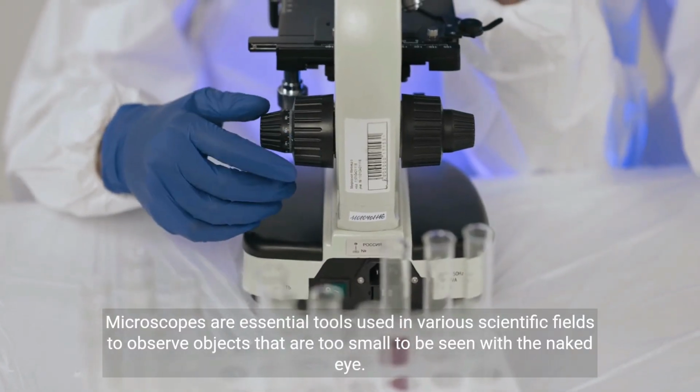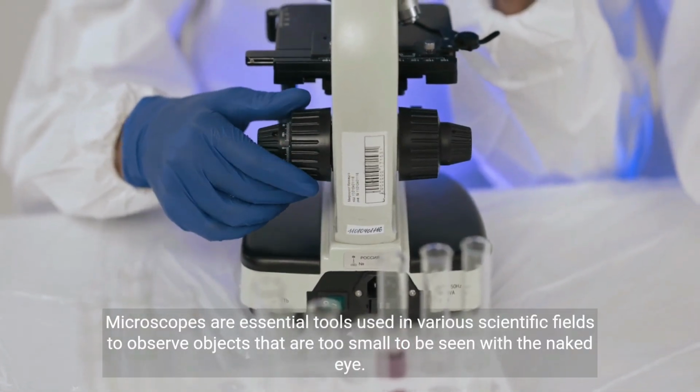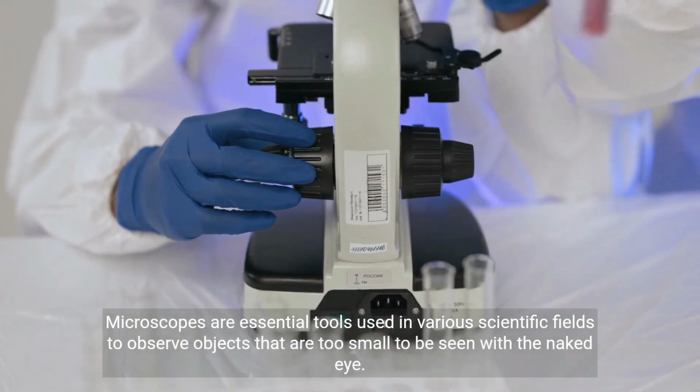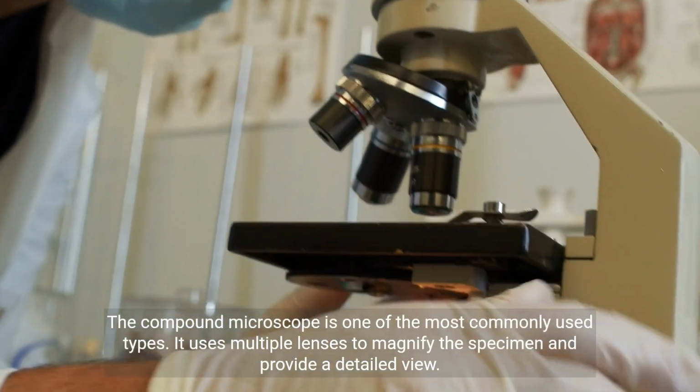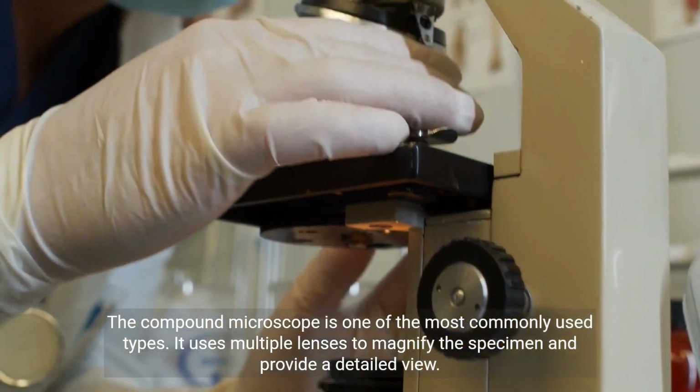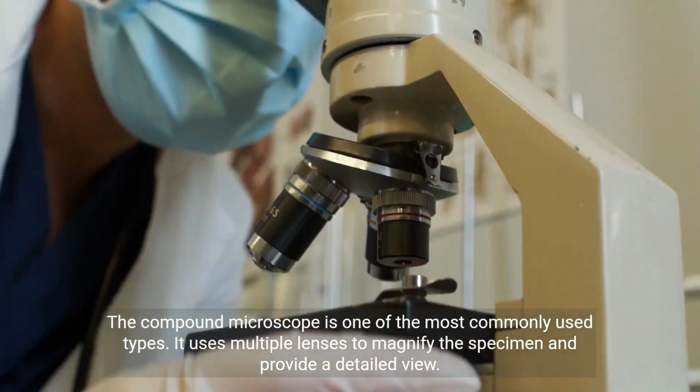Microscopes are essential tools used in various scientific fields to observe objects that are too small to be seen with the naked eye. The compound microscope is one of the most commonly used types. It uses multiple lenses to magnify the specimen and provide a detailed view.